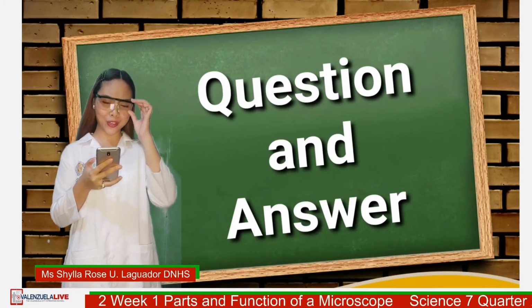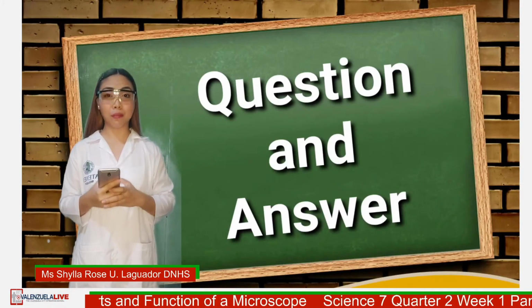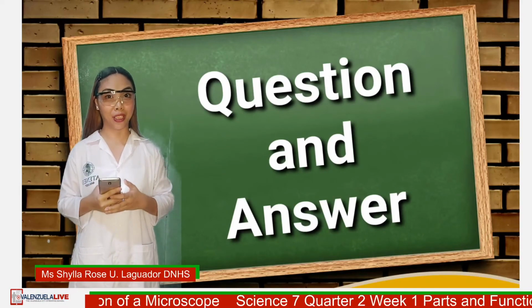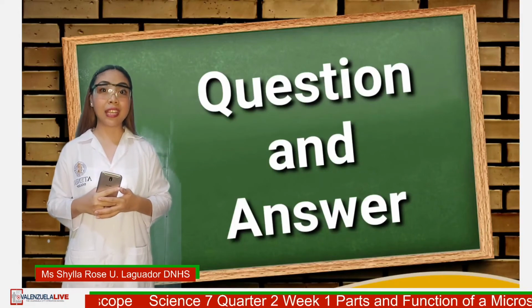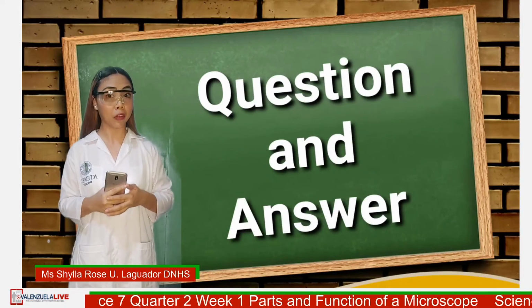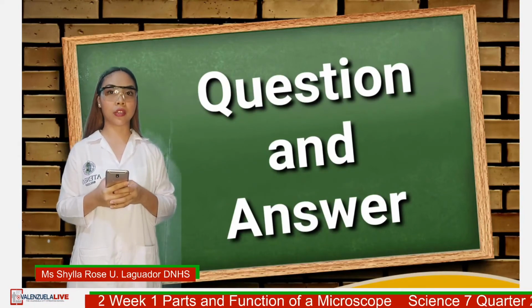Okay, interesting question. So actually, microscope is one of the most important tools used in different branches of science such as chemistry and biology. So without its discovery or invention, scientists will actually find it very challenging to study about microorganisms, cells and tissues, and even molecular structures.